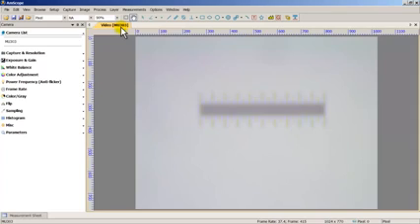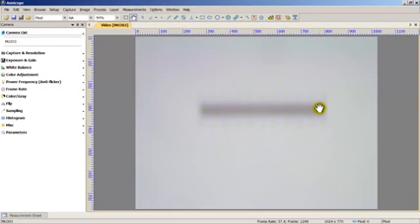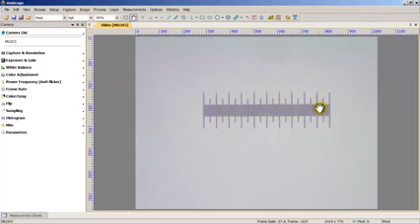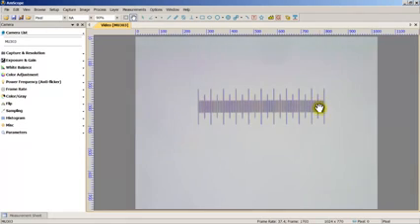And on this right now, I do have a micrometer stage slide. Basically, this stage is graduated in 0.01 millimeters, so the entire length of it, going from left to right, is 1 millimeter. So let me go ahead and refocus on that on my microscope. I'm going to use the fine adjustment tool, and as you can see, it's going to get more into focus. And that should be perfect. Okay, and right now I'm moving it around with my XY stage.